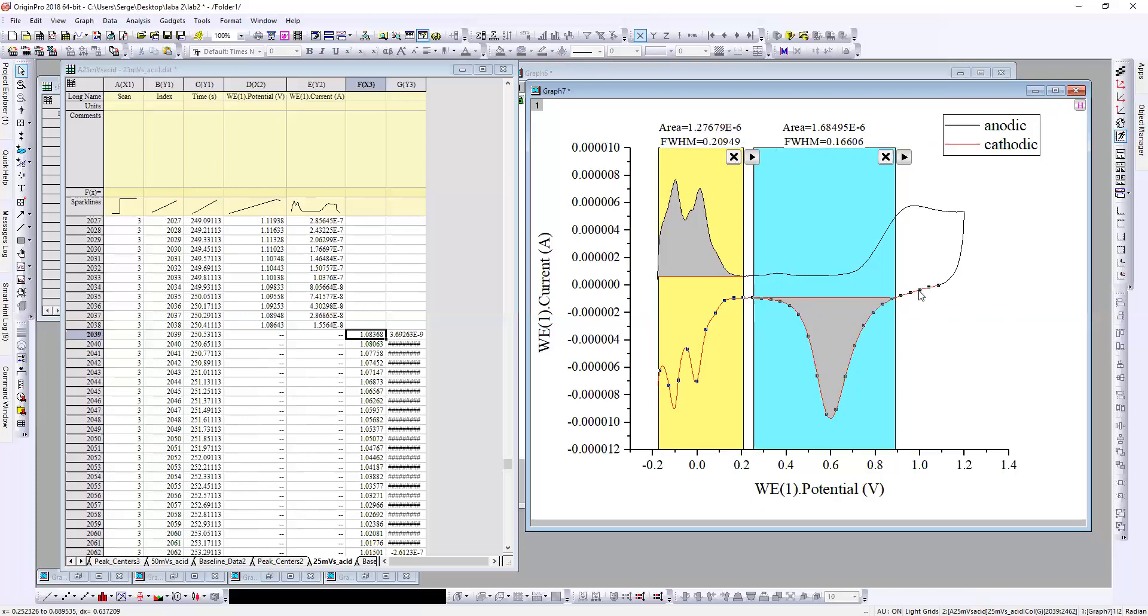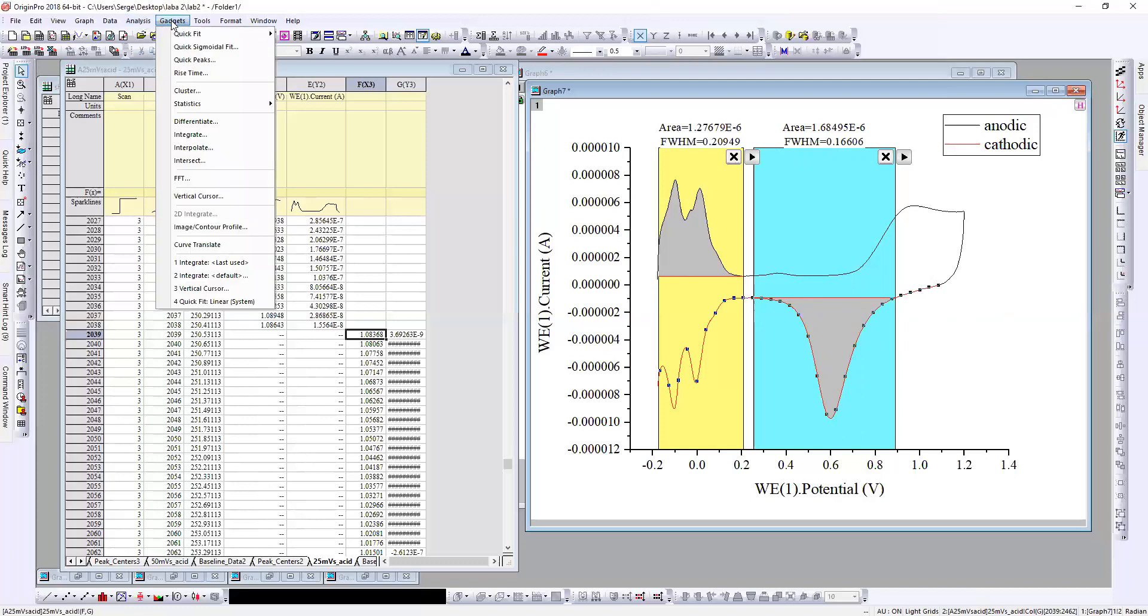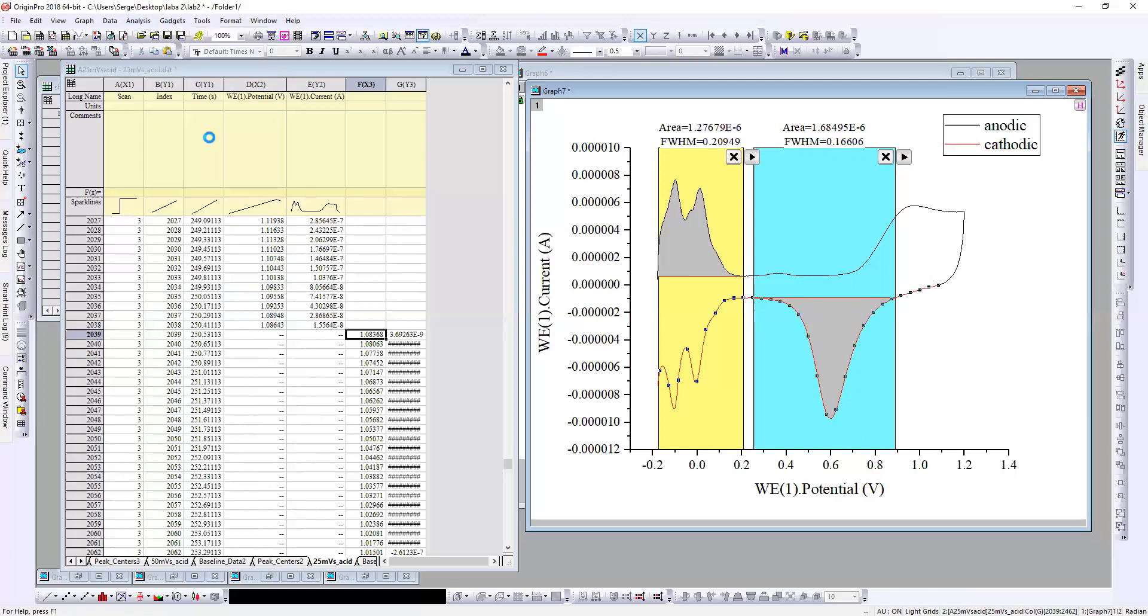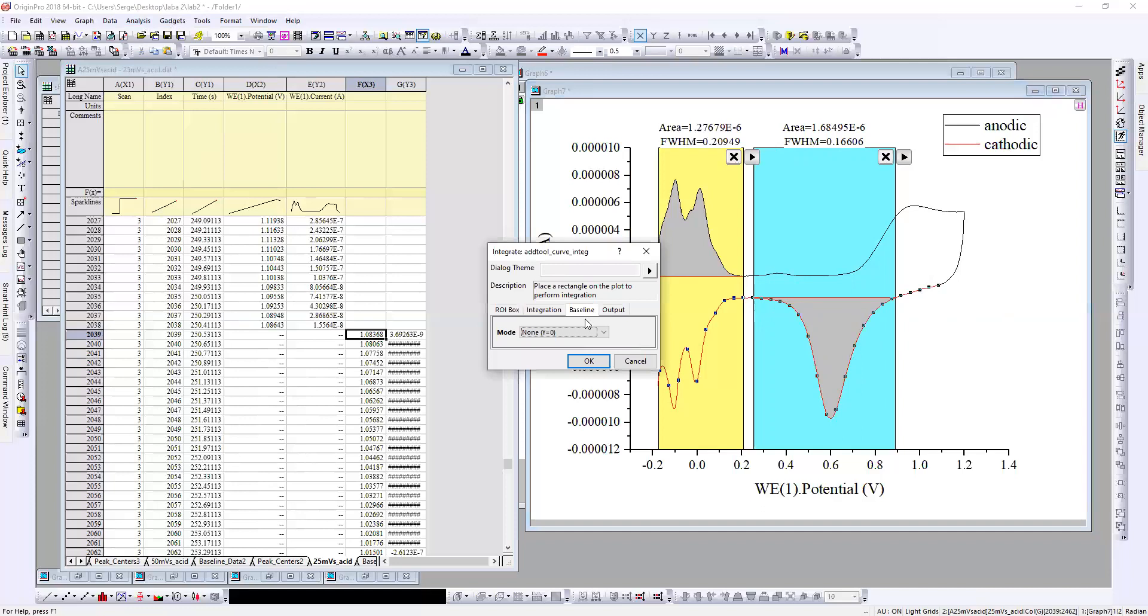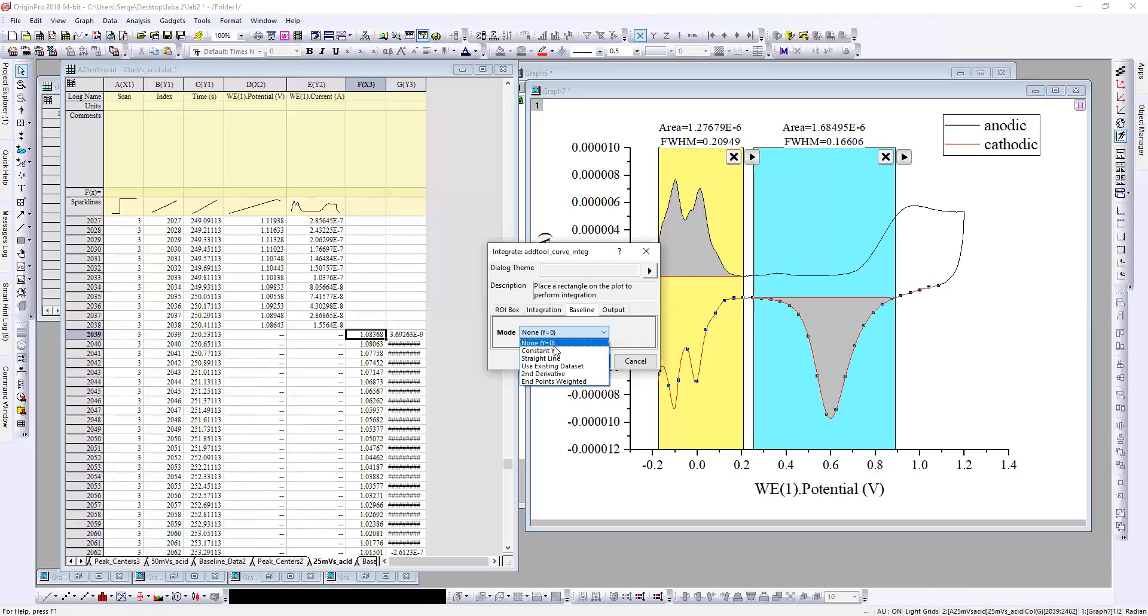Okay, I'll show again: gadgets, create baseline. And here you have a lot of different ways how to adjust your baseline.